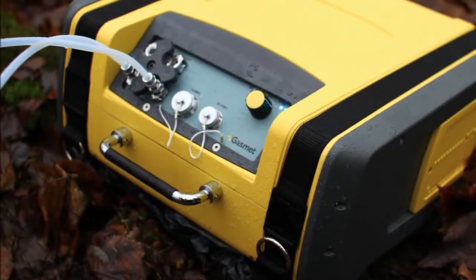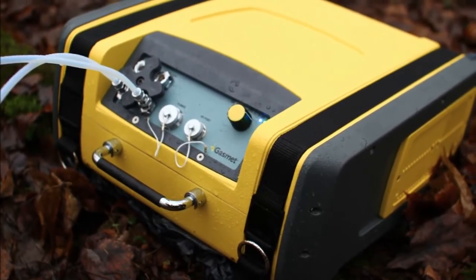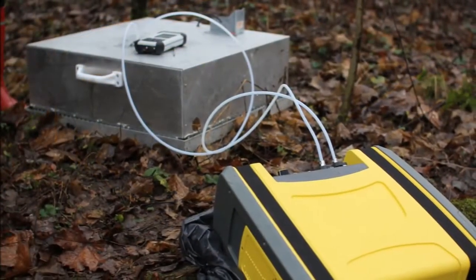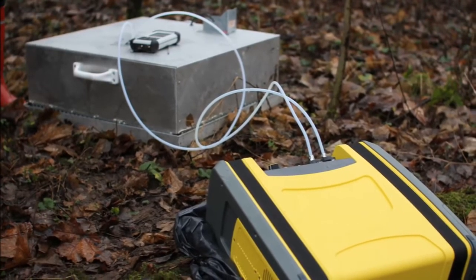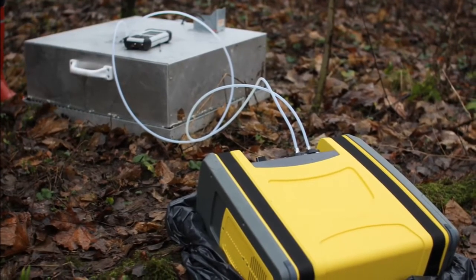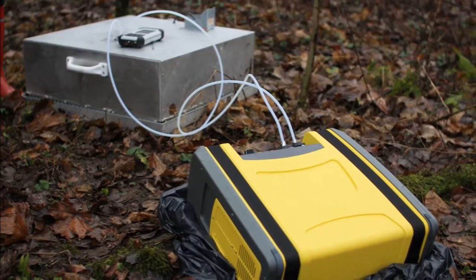This video shows how the GASMED DX4040 FTIR gas analyzer can be used in measurements of greenhouse gases emitted from soil surfaces. One of the most convenient ways to monitor greenhouse gases from soil is to use an open-bottom soil chamber integrated with a portable gas analyzer. Measurements are accomplished by capturing emission gases from the soil surface within a chamber and measuring concentration changes over time.